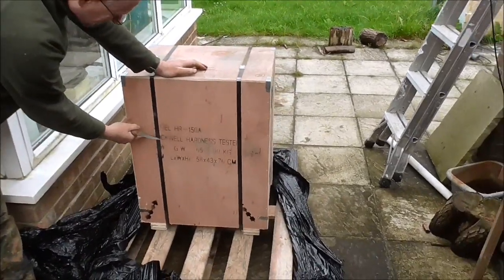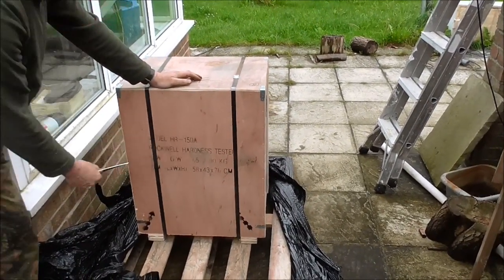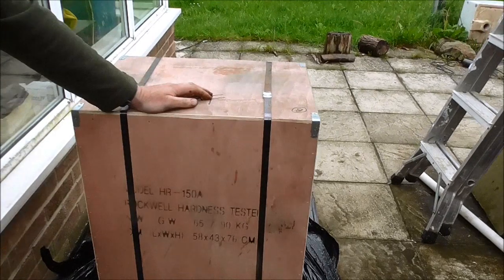Here it is, Rockwell hardness tester. I waited a long time.